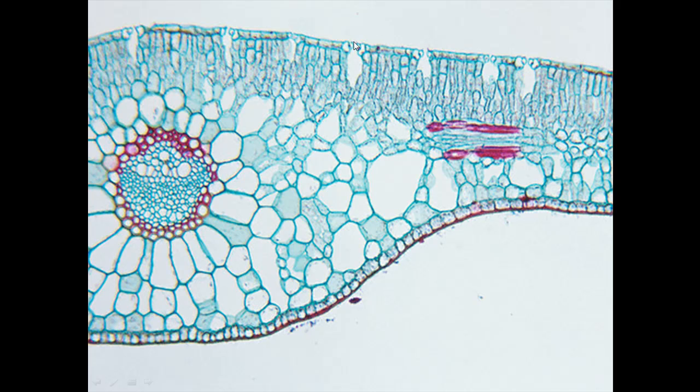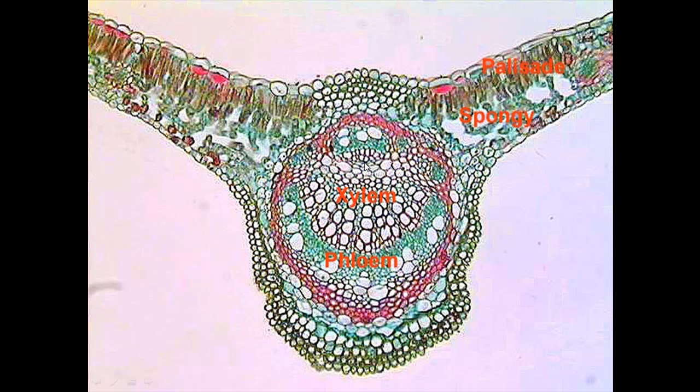These would be our stomata. We can see a little airspace going in there, and the guard cells there. Cool, here's another one. This one's actually already labeled for us, so that helps. I can see the epidermis on both sides again. Palisade mesophyll, spongy mesophyll. This is one thing that students often do badly.